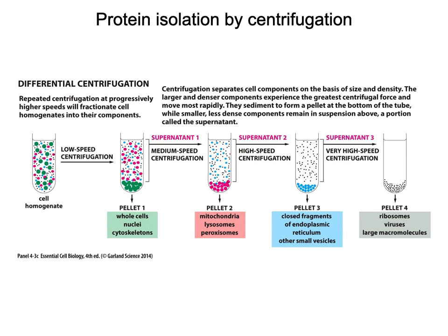We also have viruses, and if we think about viruses, for students who've taken microbiology, but also real-world application, they can range in sizes, right? And so they're relatively small, much smaller than most cells, and so if we're only centrifuging at low speeds, they're going to be in that supernate.